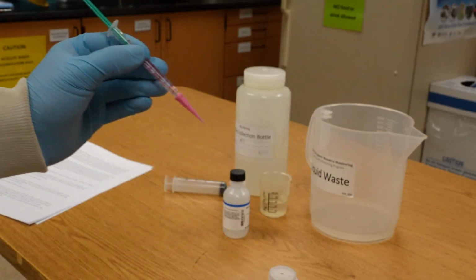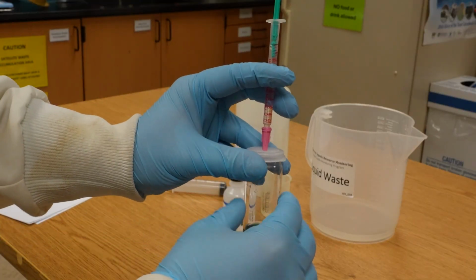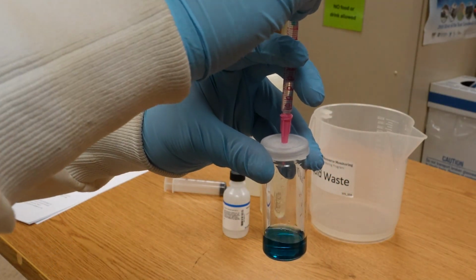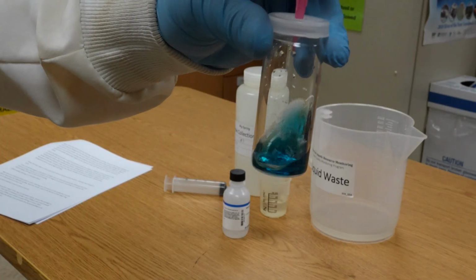Next, insert the titrator into the opening of the titration vial cap. Press on the titrator plunger to slowly dispense reagent B into the titration vial, drop by drop, while gently swirling the vial until the solution turns purple.